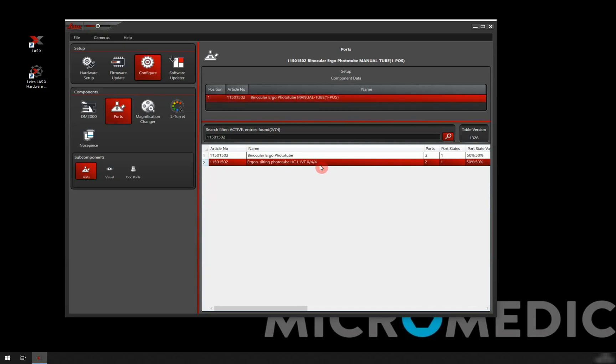This tube is a photo tube so it has two ports. It has one port for the camera and one port for the eyepieces. It has one port state, which means it has a fixed split 50-50 to the camera and to the eyepieces.